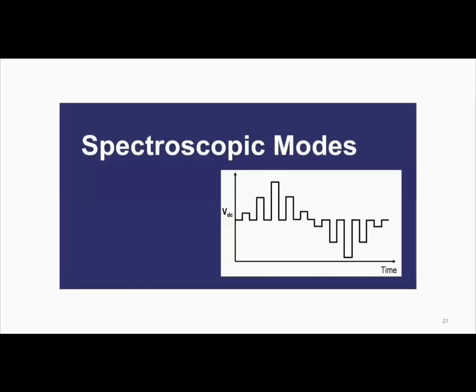So now we'll talk a little bit about spectroscopic modes. And of course, you can do spectroscopy with conducting AFM and other techniques as well. EFM, as a function of DC bias, will allow you to determine the contact potential difference. But here I'm focusing primarily on piezoresponse force microscopy.